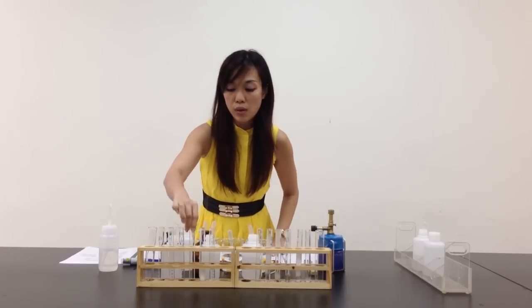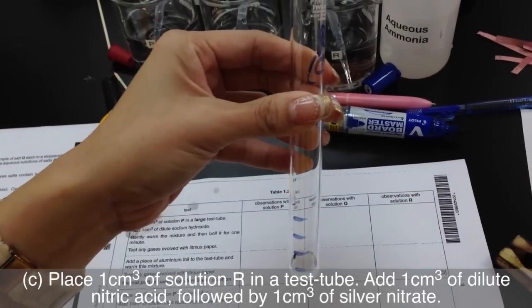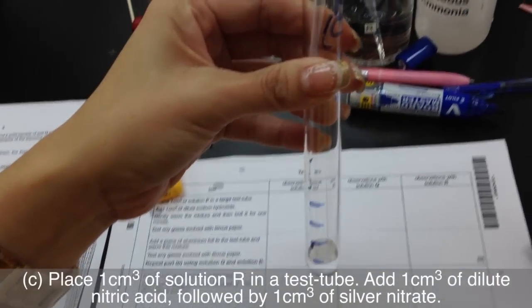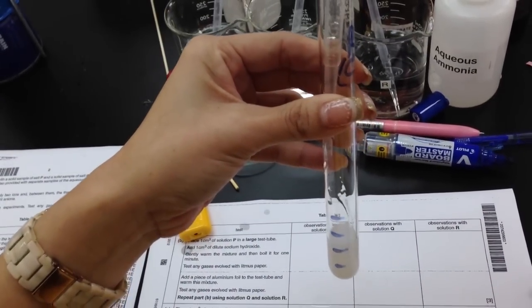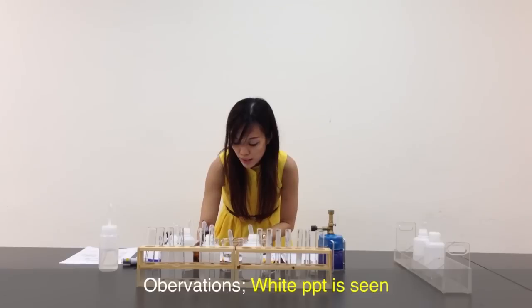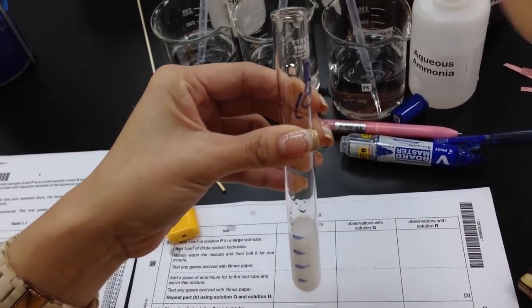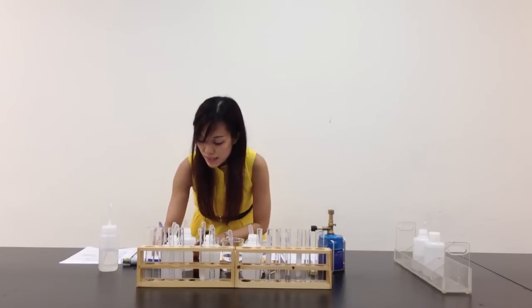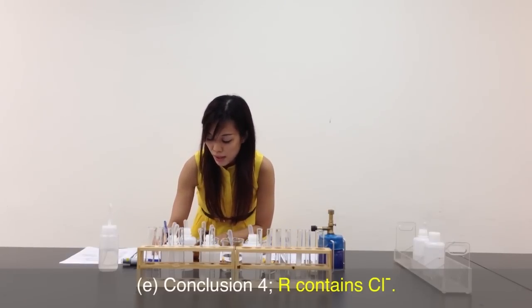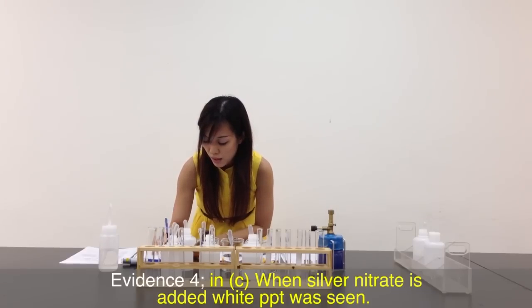Let's move on to R. Same thing — 1 cm³ of R, then 1 cm³ of nitric acid, then another 1 cm³ of silver nitrate. White PPT is seen. Not forgetting my aqueous ammonia — my white PPT remains unchanged. I can safely say that R contains chloride, because in Part C, when silver nitrate is added, white PPT was seen.